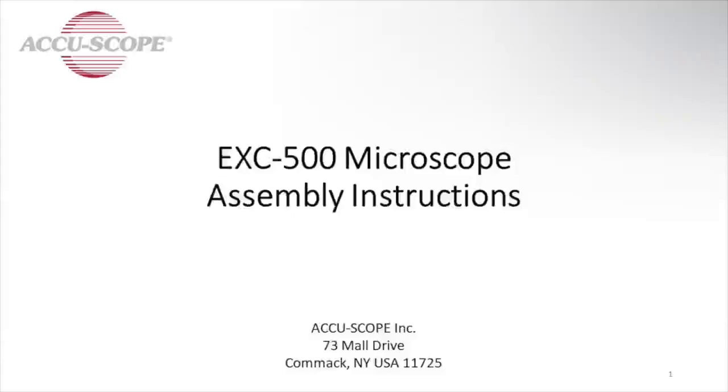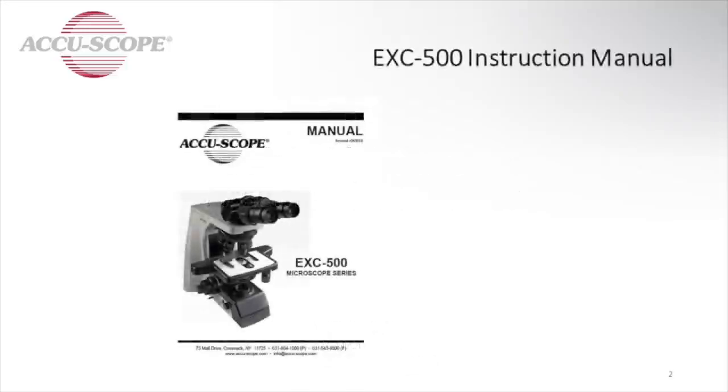Welcome to the EXC-500 assembly video tutorial. You may wish to follow along with the instruction manual that came with your EXC-500 microscope. Note that some of the steps may be slightly different for ease of assembly.